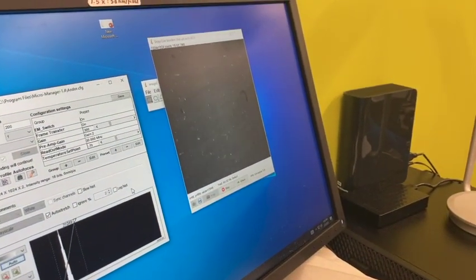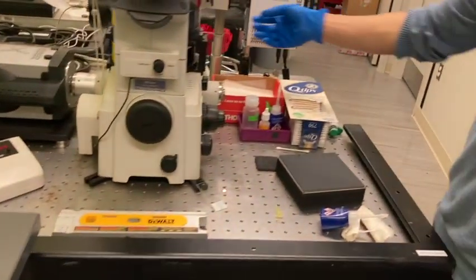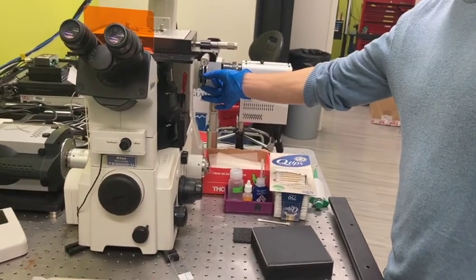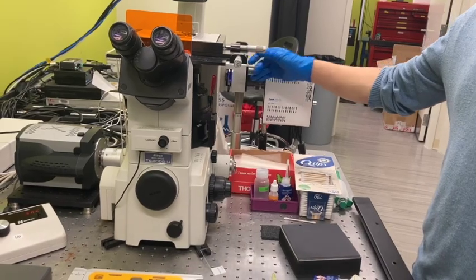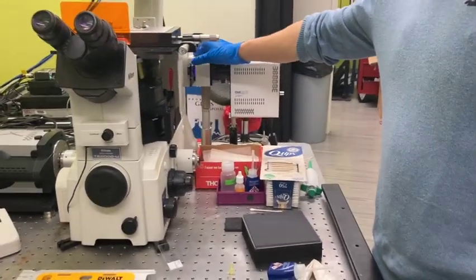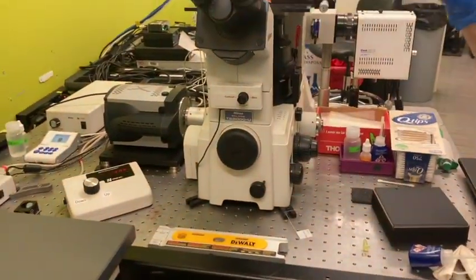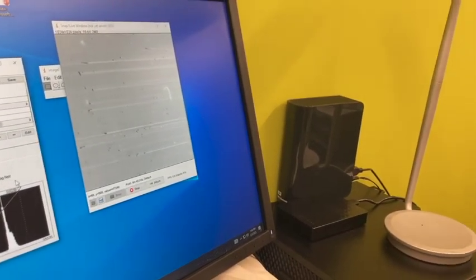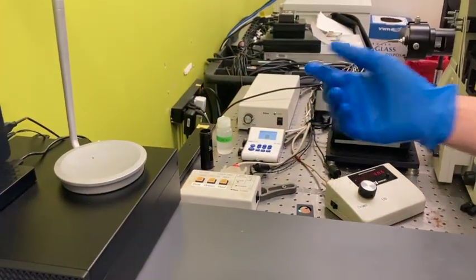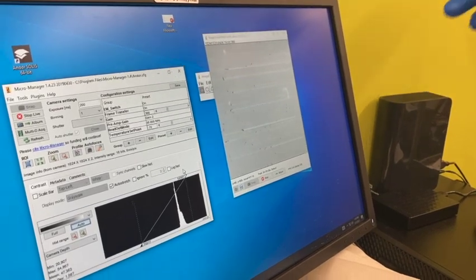Increase, and if it's not changed, next we start to use this ND filter. I pull this out, and we have just one ND inside the path, and it's brighter. And if we go all out, it's separate. So you need to kind of balance these two NDs and this power adjustment, and then get a certain mean intensity in the movie.